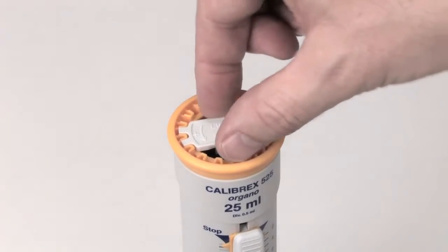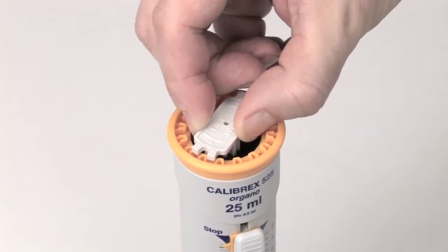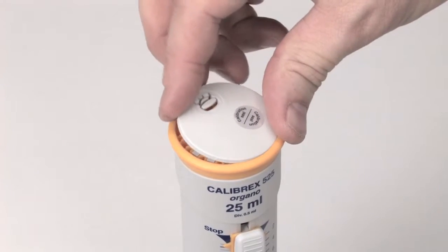When a new adjustment is required, turn the calibration key. Replace the cap and sticker when calibration is completed.